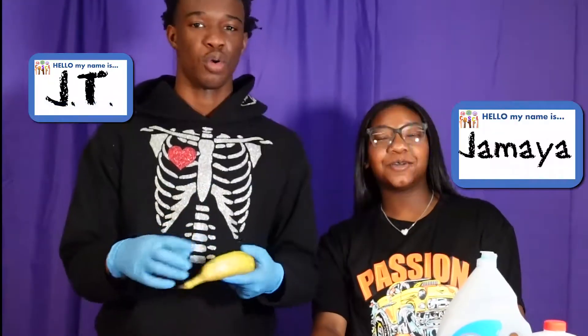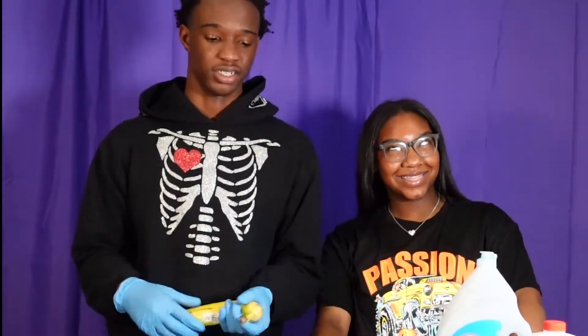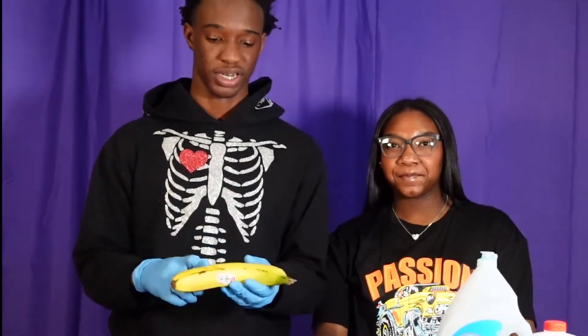My name is JT. My name is Jamiah. Welcome to CRSci. Today we are going to extract DNA from the banana.